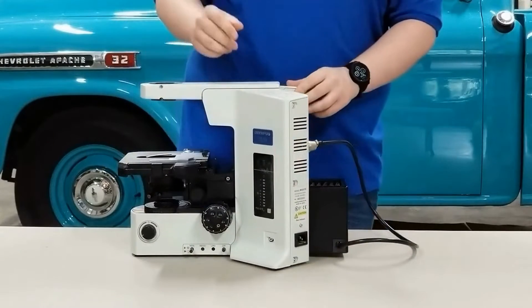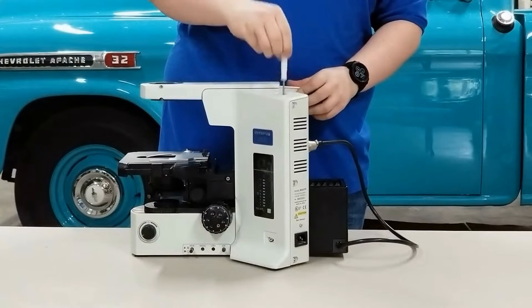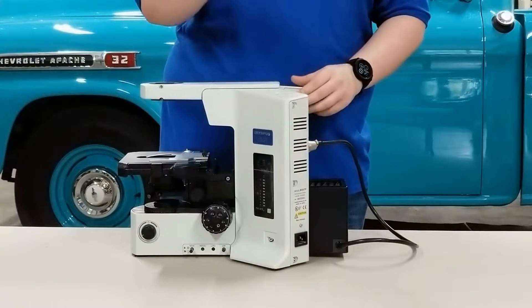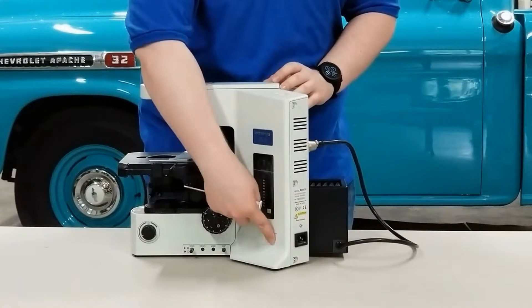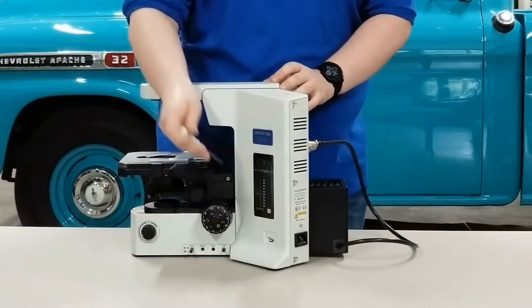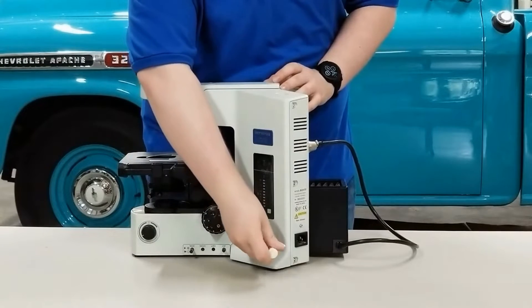First, get the three millimeter wrench from the upper right hand side of your microscope and insert it into the hole I'm pointing out here. Give it a few turns to loosen the screw and that should help remove your lamp house.